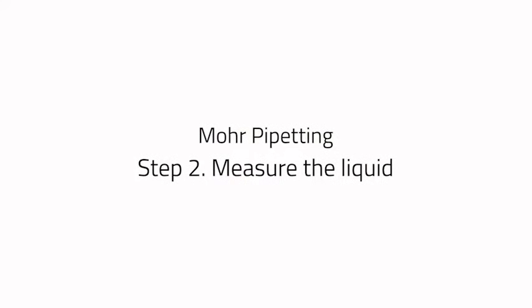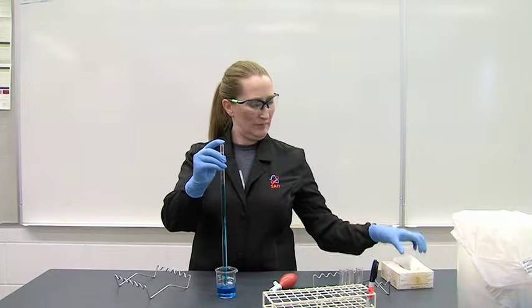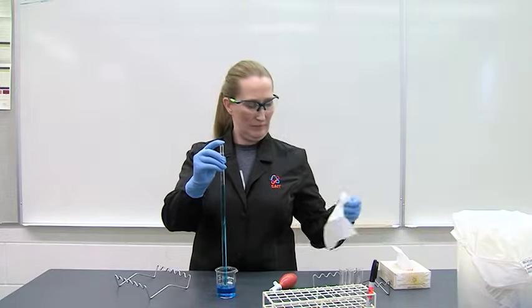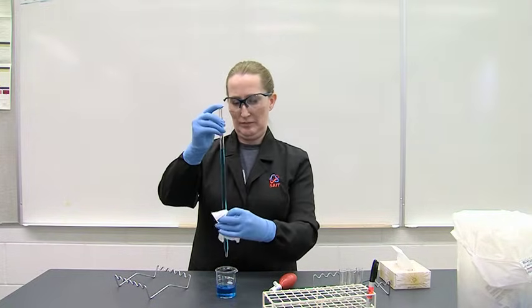Step 2. Measure the liquid. Lift the pipette out of the liquid and wipe any excess liquid from the outside of the pipette without touching the bottom.